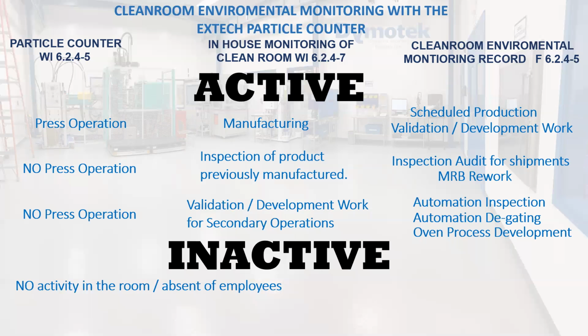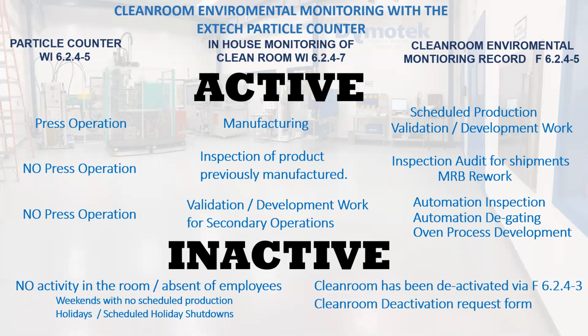The room will be considered inactive if there is no activity in the room and it is absent of employees for a complete 24-hour period. An example of this would be weekends with no scheduled production, holidays or scheduled holiday shutdowns, or if the clean room has been deactivated via Form 6.2.4-3, the clean room deactivation request, which is typically filled out by maintenance. This is usually for when maintenance needs to go into the clean room and the work that they are doing will disrupt the environment. So we have to shut the entire environment down.